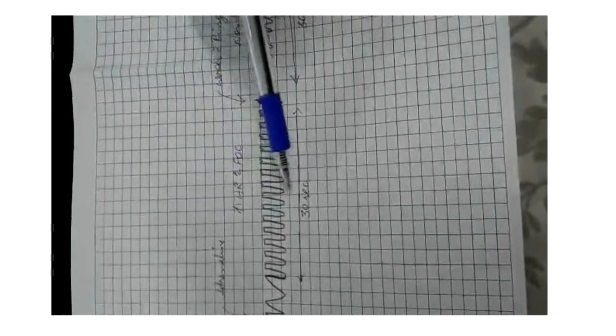But if someone asks you that why do you think this is adrenaline and not digoxin, as you know that digoxin is also an inotropic drug. So digoxin, you should not confuse that digoxin only increases force of contraction, and digoxin decreases heart rate, whereas adrenaline increases both of them.